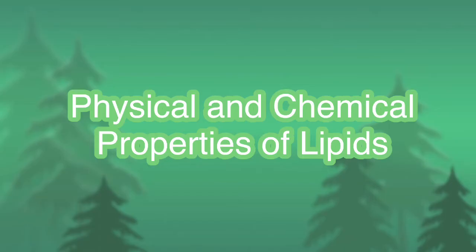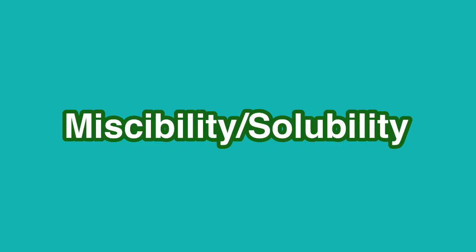For today's experiment, we will be utilizing the two commonly encountered lipids, your triacylglycerol in the form of oil, and of course your cholesterol. Let us begin by determining the miscibility and solubility of oil and cholesterol in different solvents.